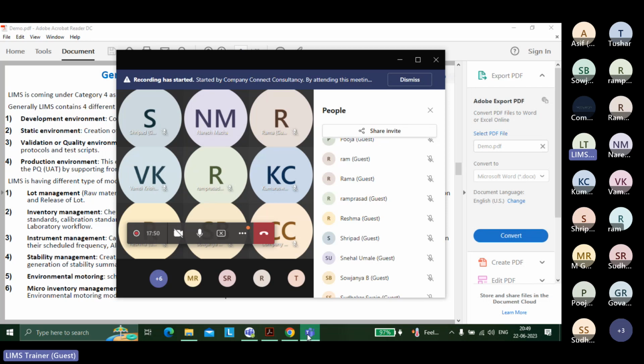Then I went a bit farther, and I explained how the table structure is built inside LIMS, inside LabWare. I need to take one particular tool and explain, so that you get some idea about how the tables are built in LIMS, and you can relate later that okay, I am using this LIMS, this has to be this way. Because in all LIMS there has to be one sample table, inside that one test table, inside that one result table. So some generally used tables, how to write queries, how to understand those table structures, I always teach them.